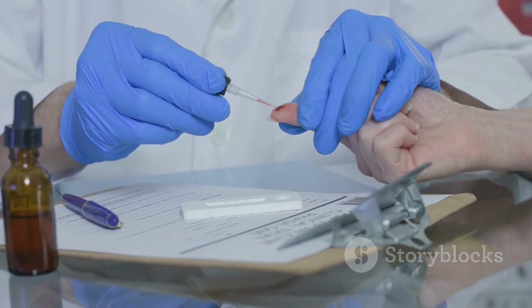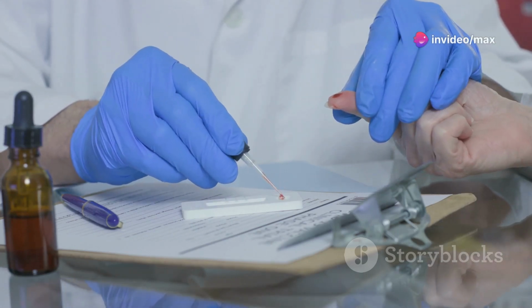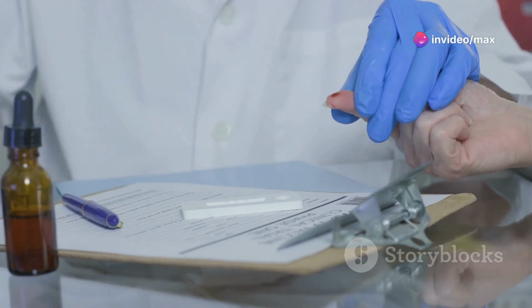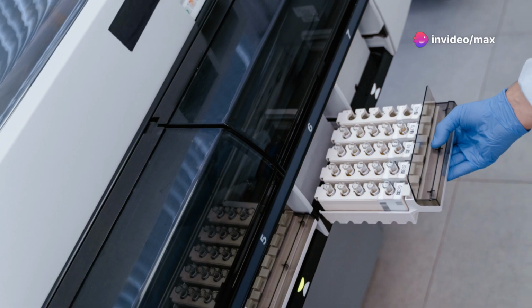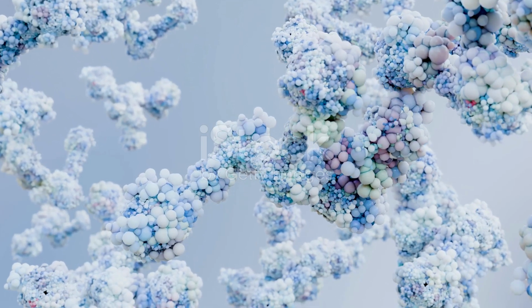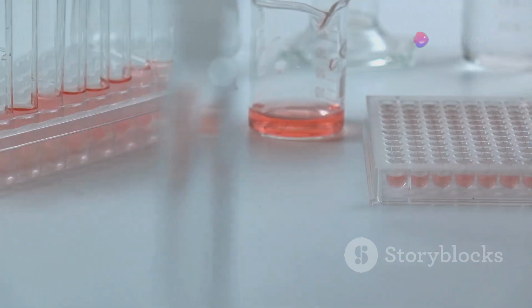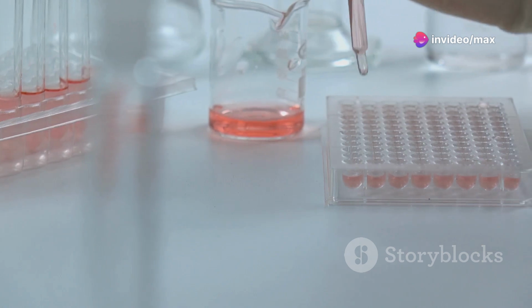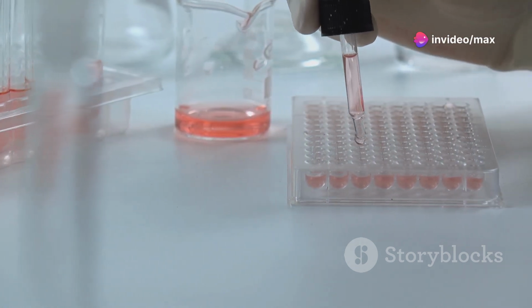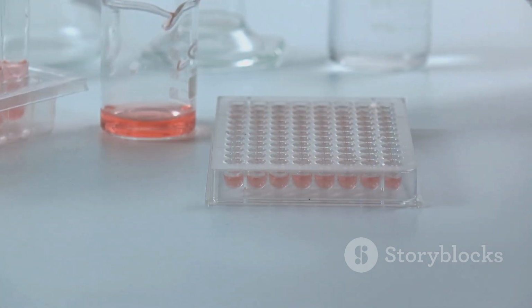Instead of directly adding an enzyme-linked antibody specific to the patient antibody, we introduce a secondary antibody. This secondary antibody is designed to bind to the constant region of the primary antibody from the patient's serum. The secondary antibody is linked to an enzyme, and upon substrate addition, a color change indicates a positive result.